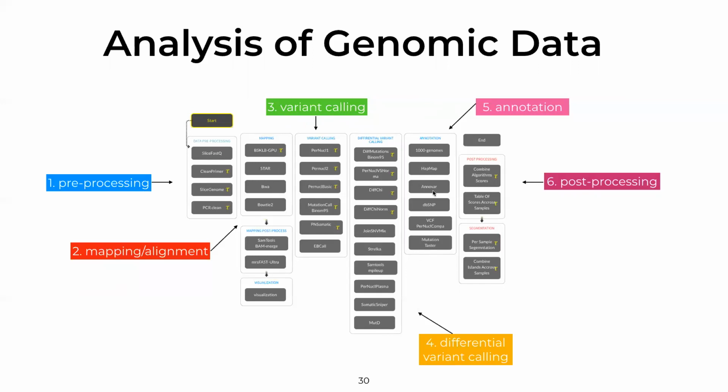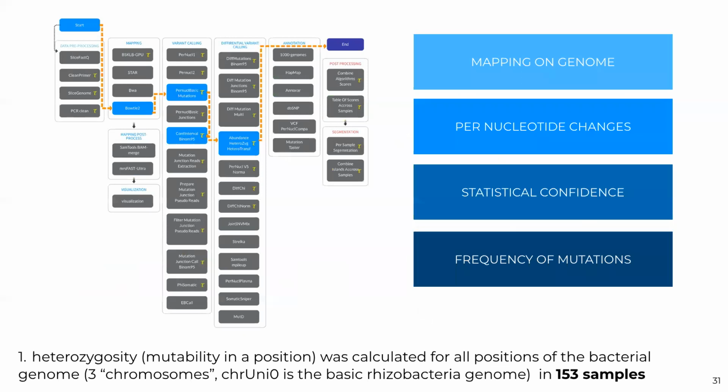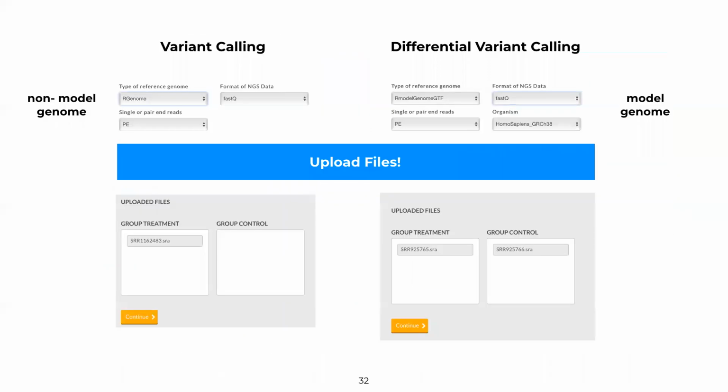Yes, Zainab, we will definitely send you a PDF of Genomics 1. And then post-processing. What is the significance of those steps? We also looked today at one of the possible pipelines, and one of the other sessions that we will have will be looking at statistical confidence and detection of frequency of mutations, which is going to be helpful. So for example, in the Genomics 1 course, you will read about uploading of the files and separating them into tumor versus normal, and then processing that data.